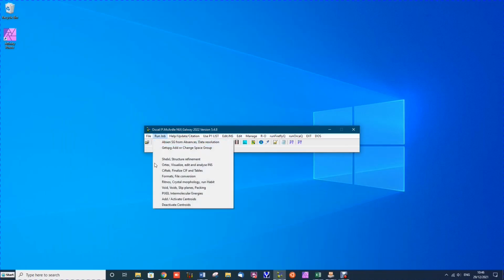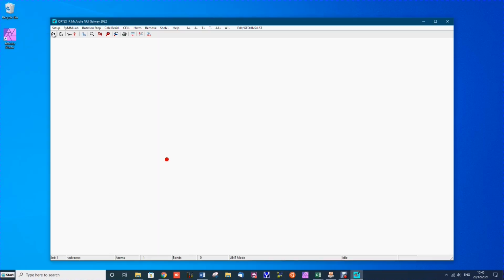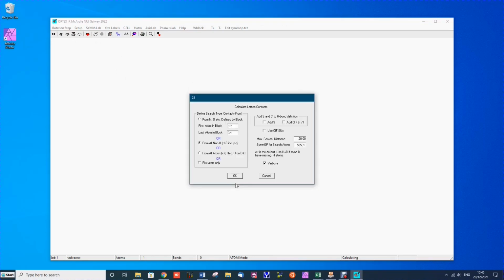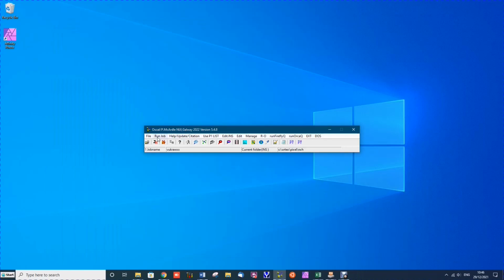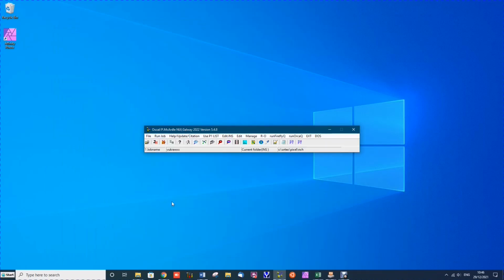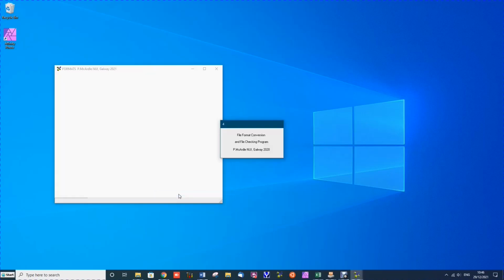Open and close Ortex and then add or activate Centroids. We now have the Centroid. You may or may not see the Centroid. Do a lattice scan, or calculate contacts, for this. The default distance is set to 20 angstroms, which is satisfactory. Use all defaults on this, and we now have the lattice scan done. We can deactivate the Centroids now, and we're ready to run Pixel.